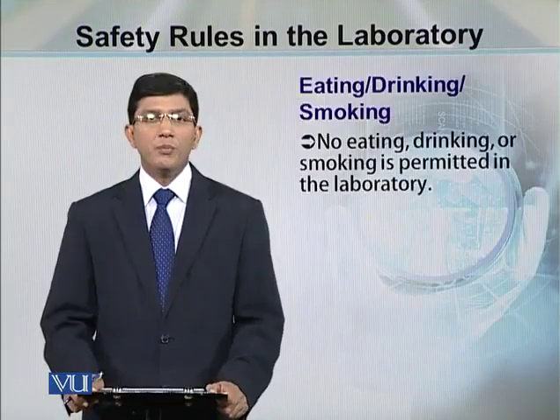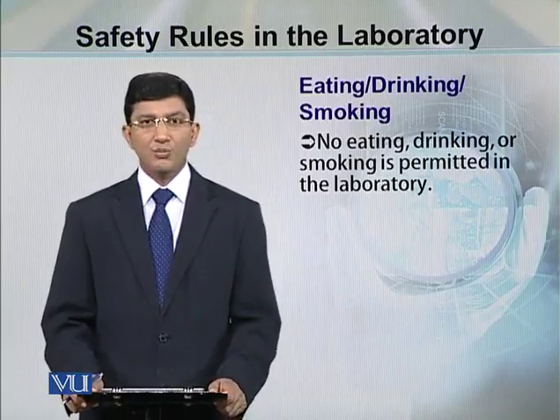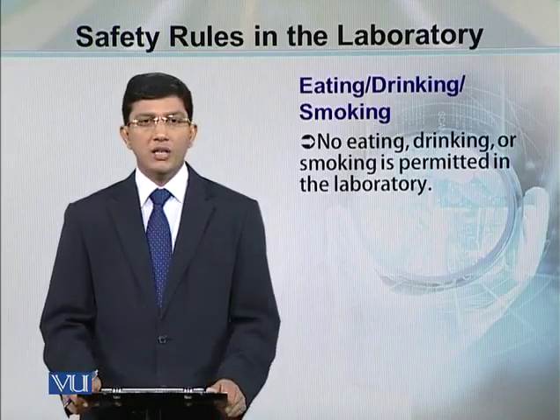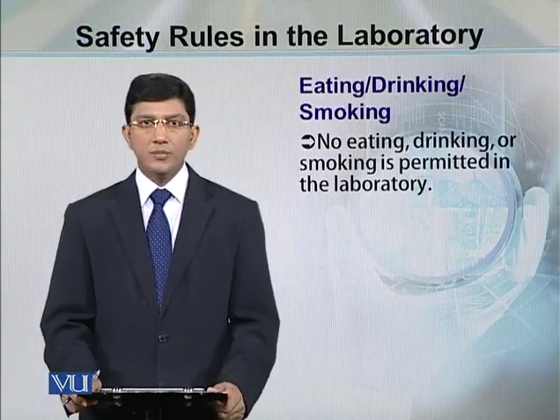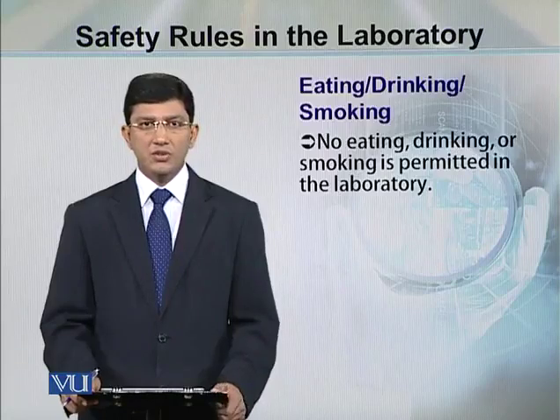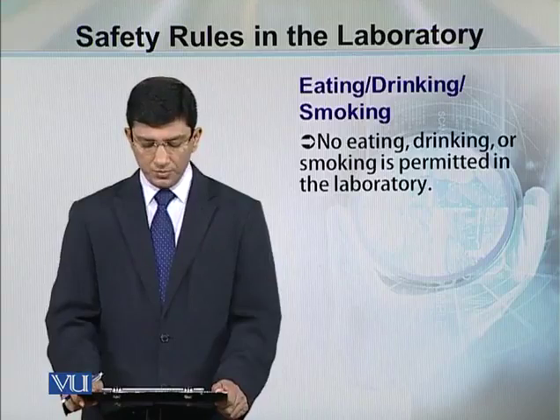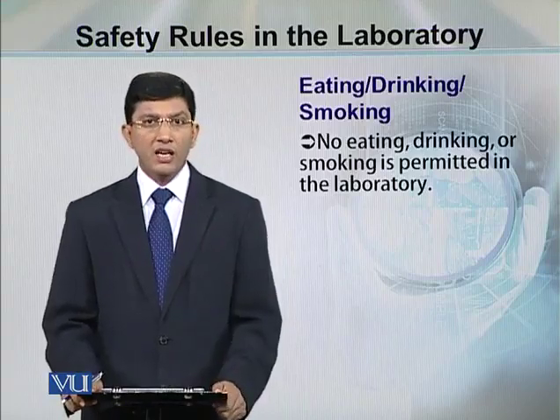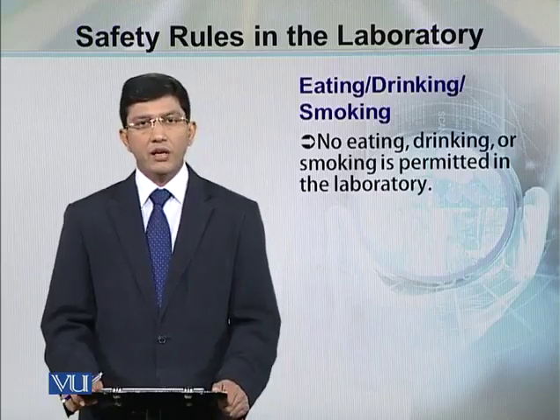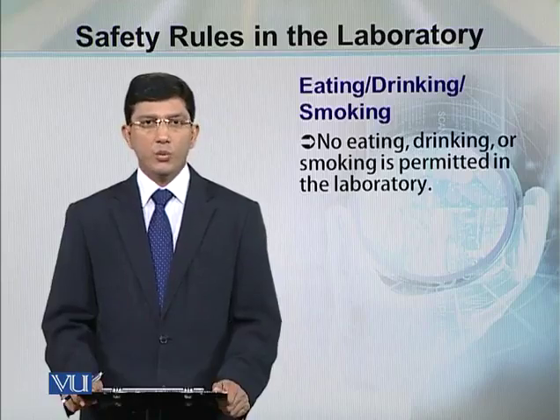As a principle, you are not allowed to eat or drink or smoke in the laboratory. Eating or drinking within the laboratory can be toxic for yourself. The food or the liquid can get contaminated with the toxic materials which can be dangerous for your health and can also cause death of the researcher. And smoking can ignite or can provoke fire in the laboratory. So be aware of the fact you are not allowed or you should not eat or drink or smoke within the laboratory.